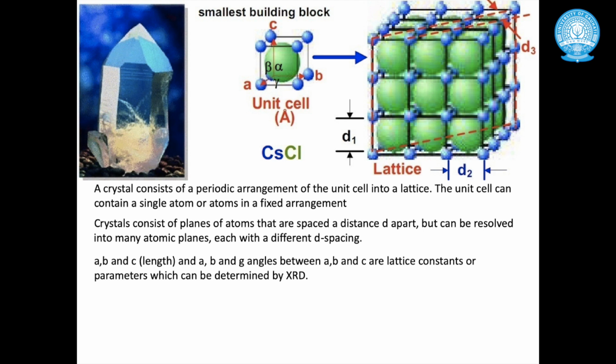X-ray diffraction has been developed to study the structure of all states of matter with any beam, that is, in this case X-ray, and the beam source may be ions, electrons, neutrons and protons with a wavelength similar to the distance between the atomic or molecular structures of interest.